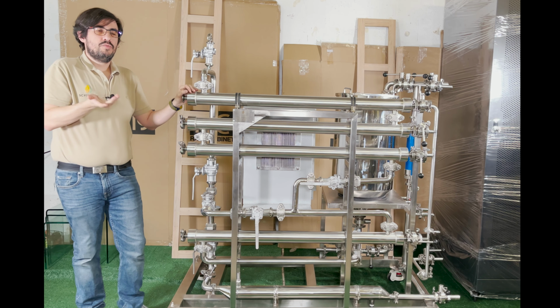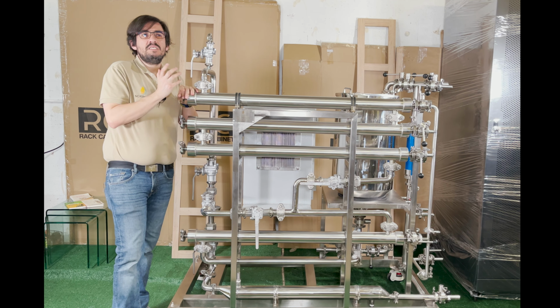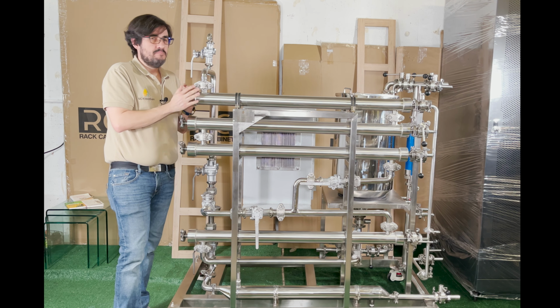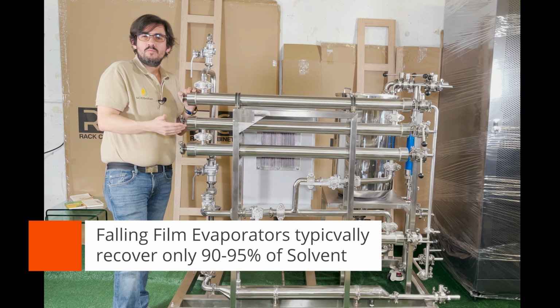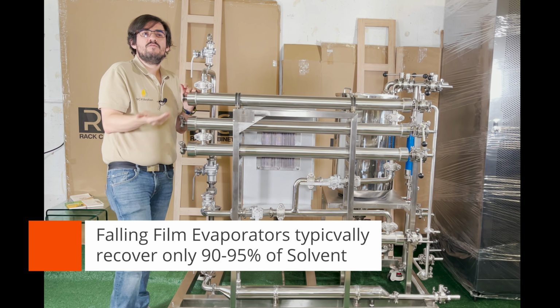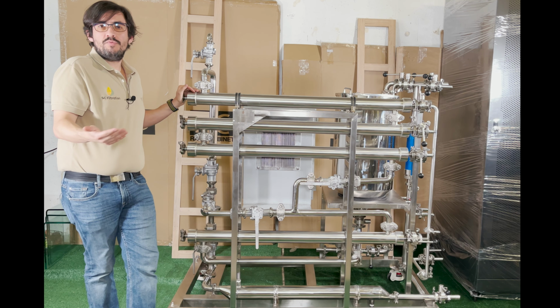And so one of the critiques may be, well, but it's not really getting all of the solvent. Yes, but the machine is able to remove about 89 to 90% of the solvent, just enough for it to be viscous enough to flow through the next process.